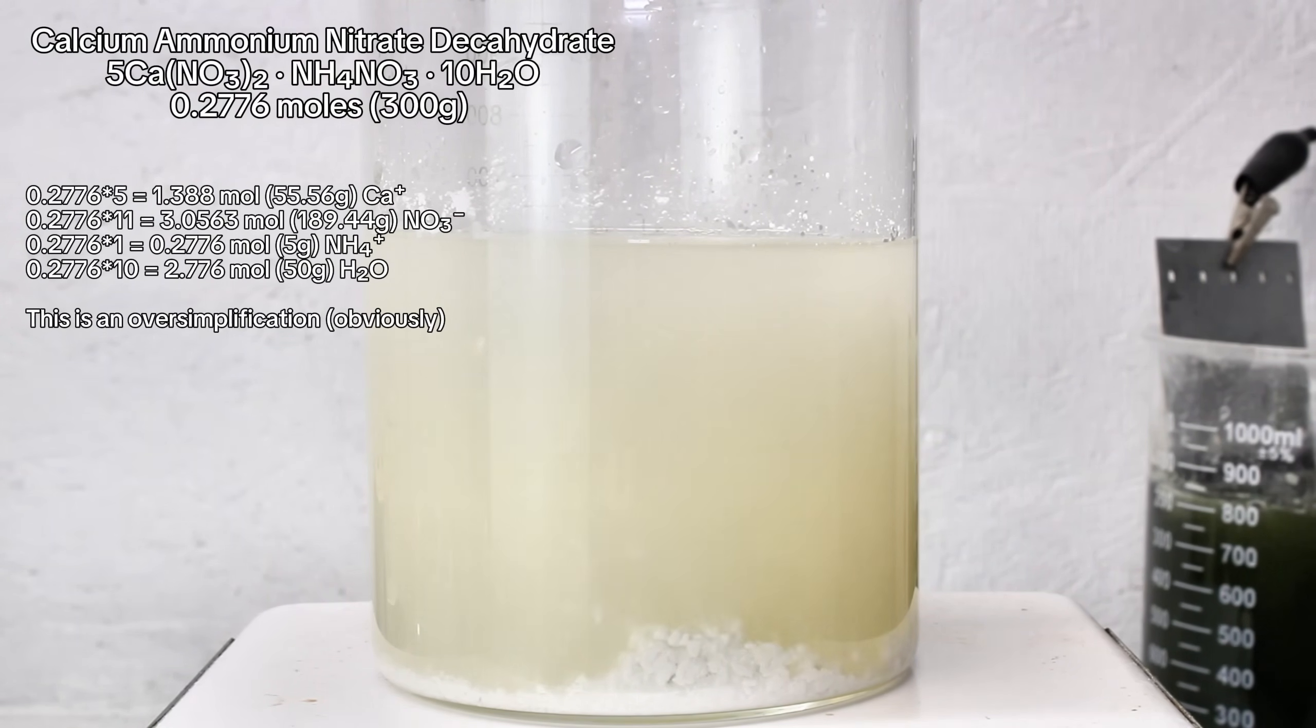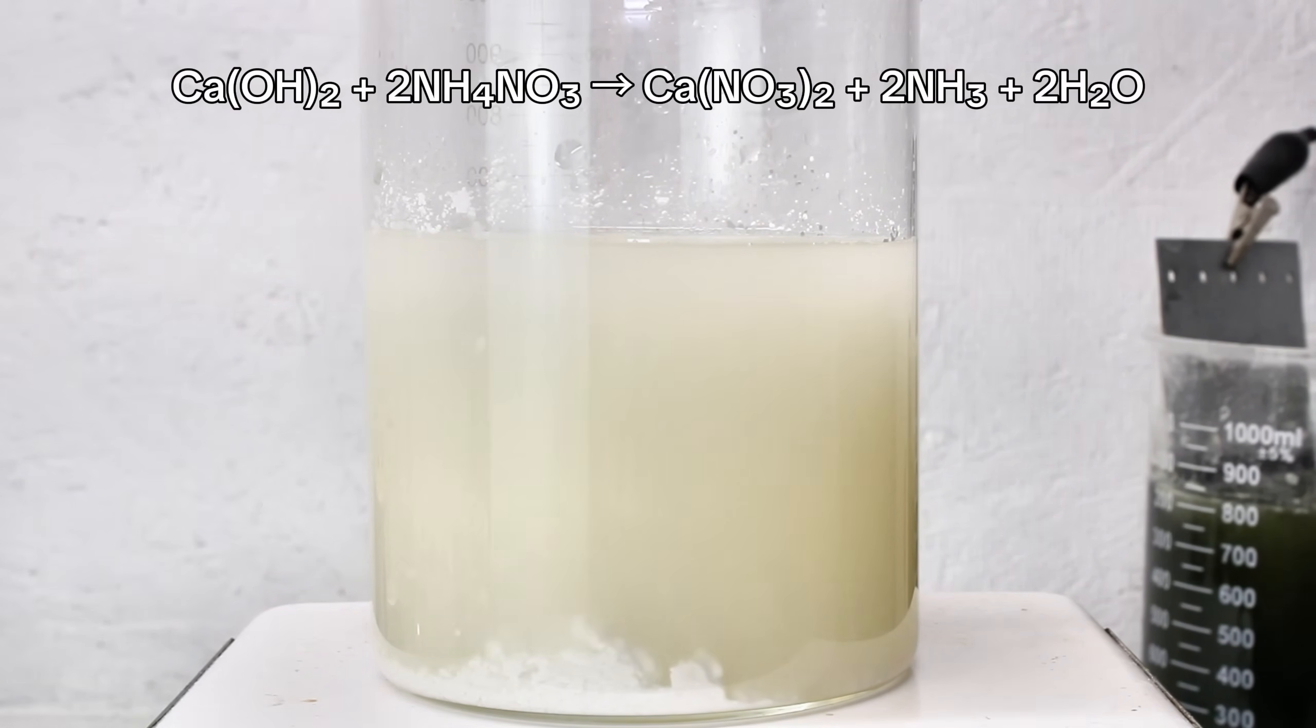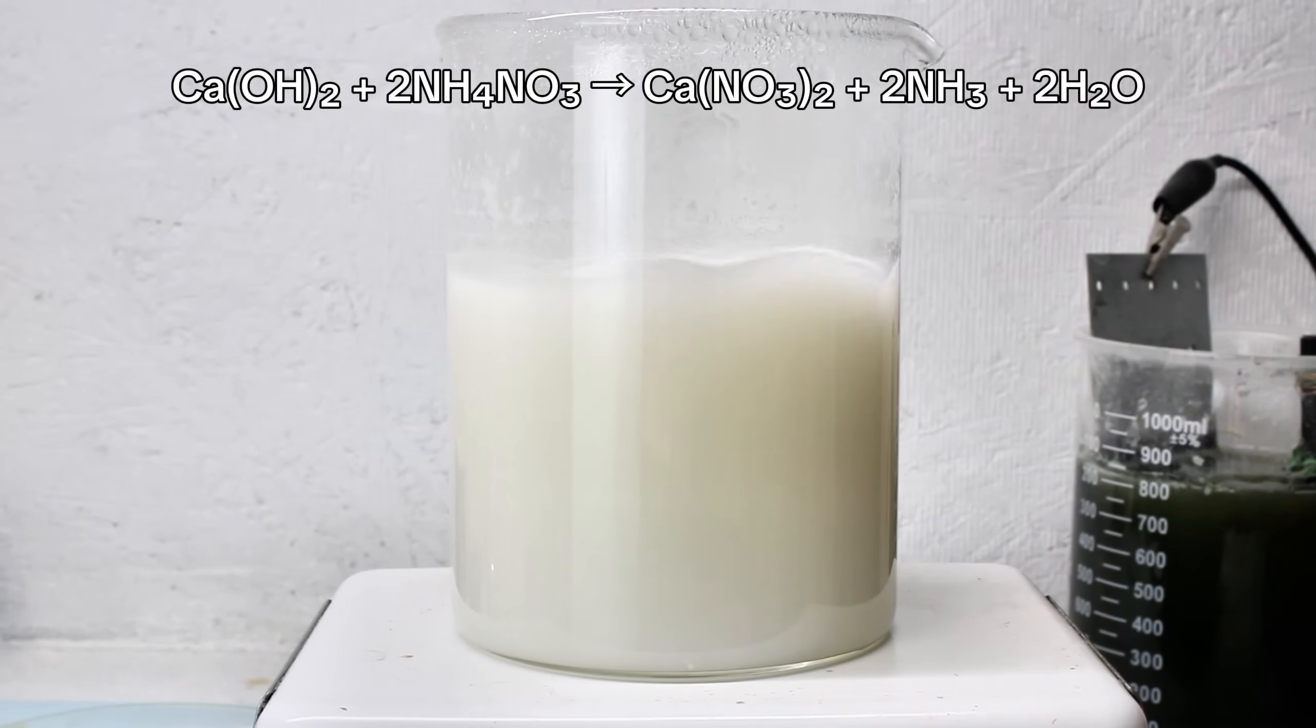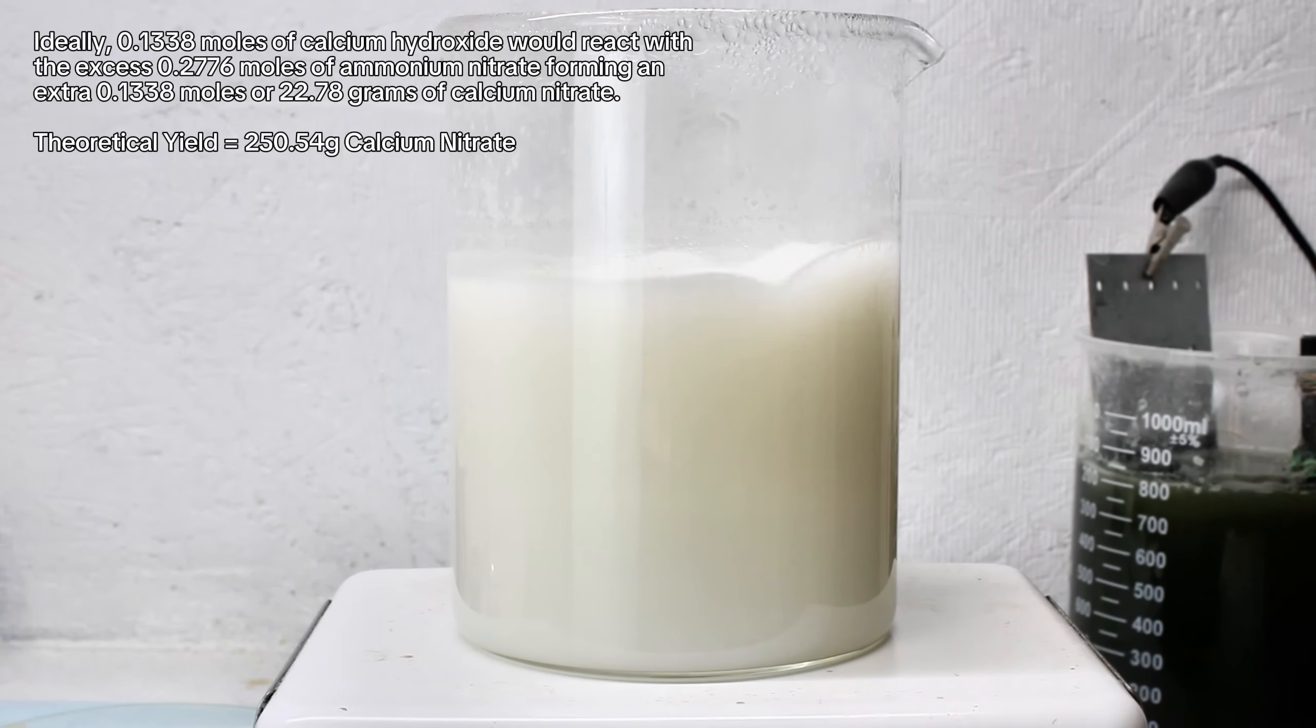Adding calcium hydroxide under heat will force a reaction between one molecule of calcium hydroxide and two ammonium ions forming two molecules of water and two molecules of ammonia gas, leaving the calcium ion behind to react with two nitrate molecules forming an additional molecule of calcium nitrate. Ideally, this reaction will purge all ammonia from solution while also generating an extra 22.78 grams of calcium nitrate to bring the theoretical yield to 250.54 grams of pure calcium nitrate.